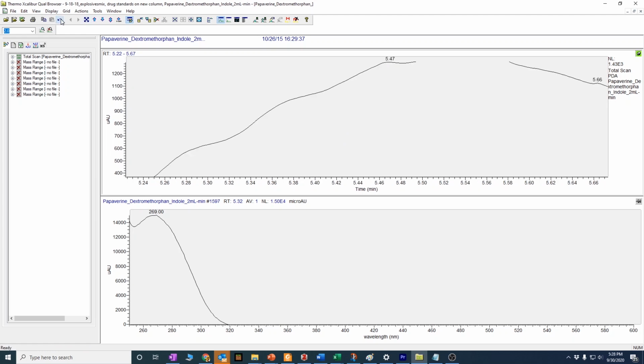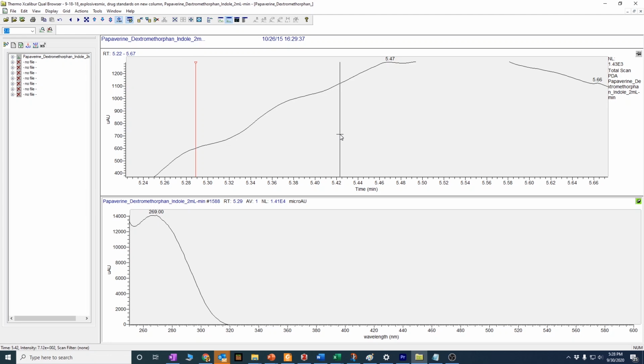Let's zoom out just a little bit there. Okay. Spectrum 1588. That's spectrum 1589. That's a dot, and it's drawn a straight line. It didn't catch anything in here. It's busy. It collects this spectrum, and then it takes this amount of time to collect spectrum 1589, 1590, 91.